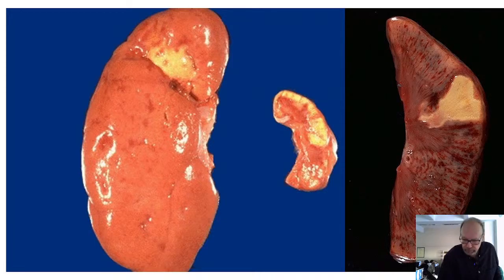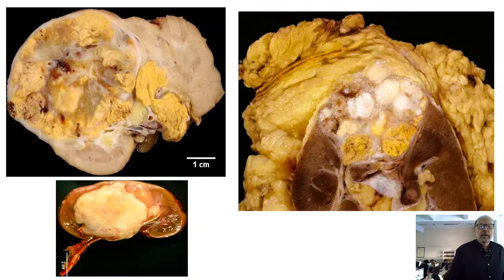On the right, here we have neoplasms. You see that many neoplasms in the kidney are malignant despite their smooth margin. The margin is not infiltrative, at least from a macroscopic point of view. However, you see that it is somehow orange.